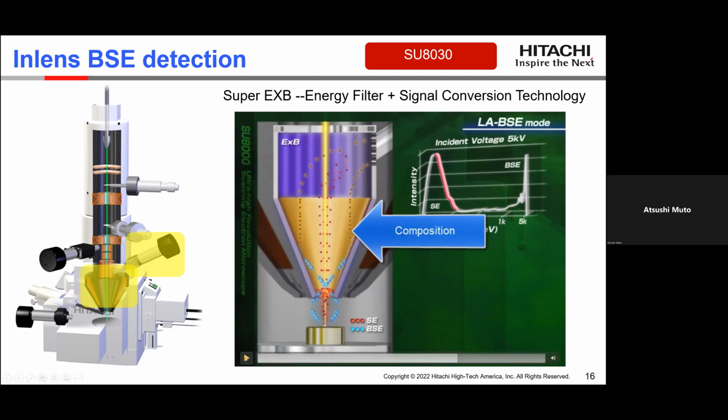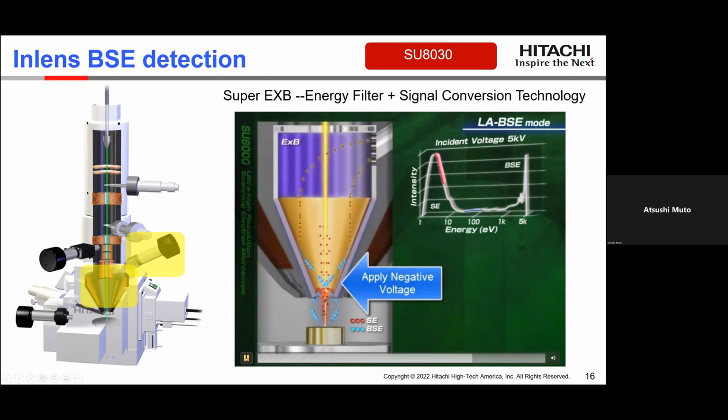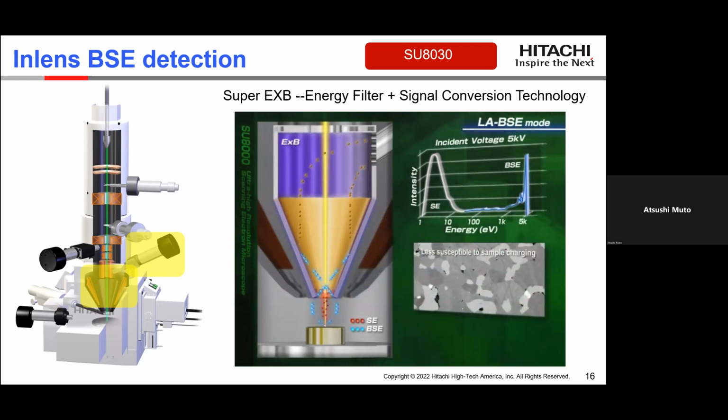What happens to the signal behavior of the secondary and backscattered electrons is that the backscattered electron signal hits the inside of the objective lens, but this lens electrode is negative. So secondary electrons are now released from the electrode and go towards the secondary electron detector. Normal pure secondary electrons are blocked by the very strong negative electric field around the bottom of the objective lens. In this way, we are filtering the secondary electron signal and allowing the secondary electrons generated by the backscattered electron signal. By this conversion, we can detect the backscatter signal.